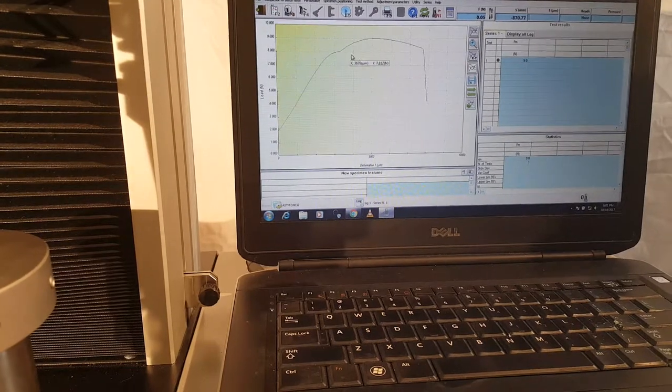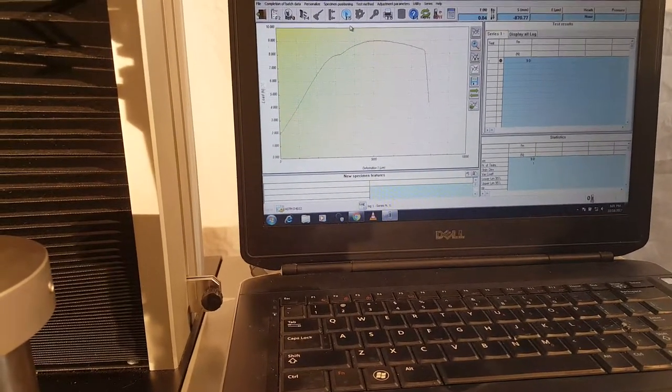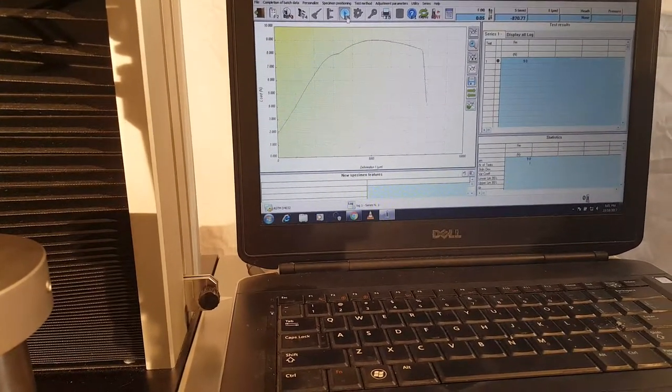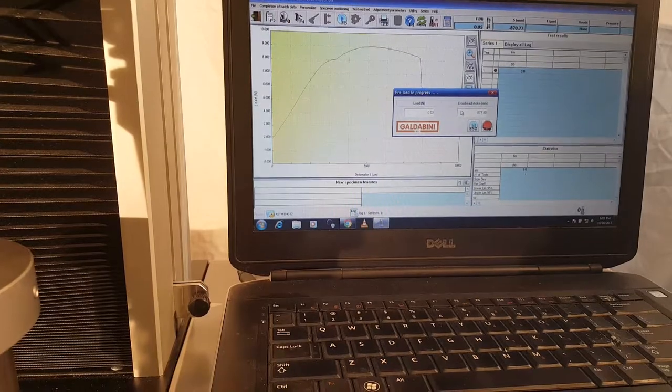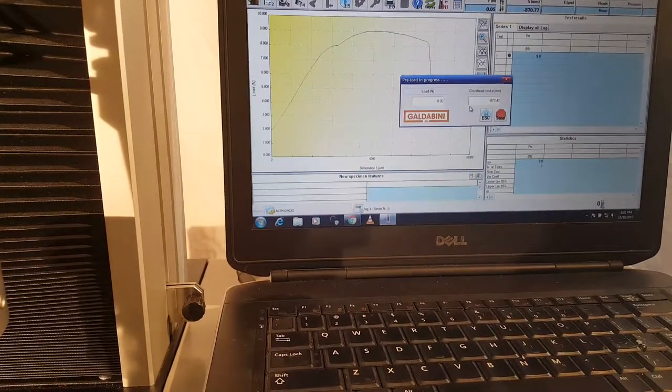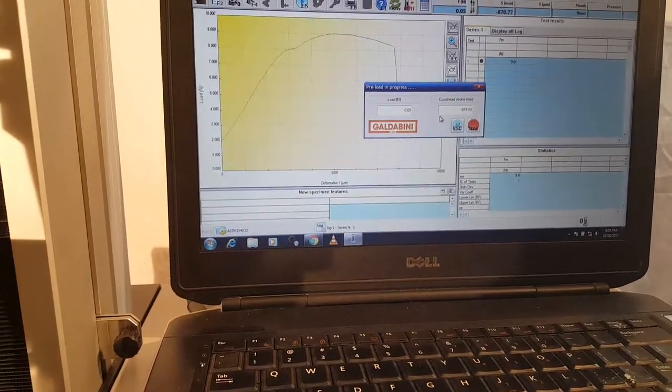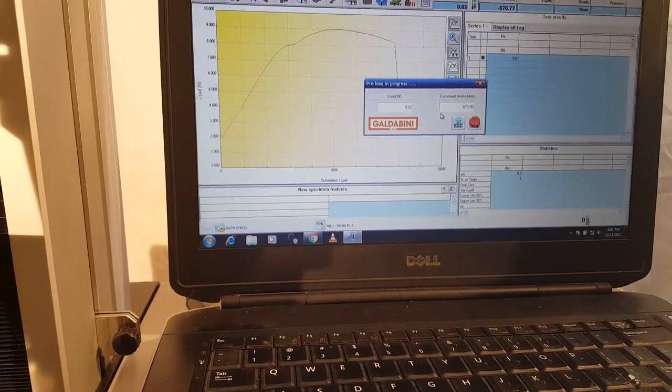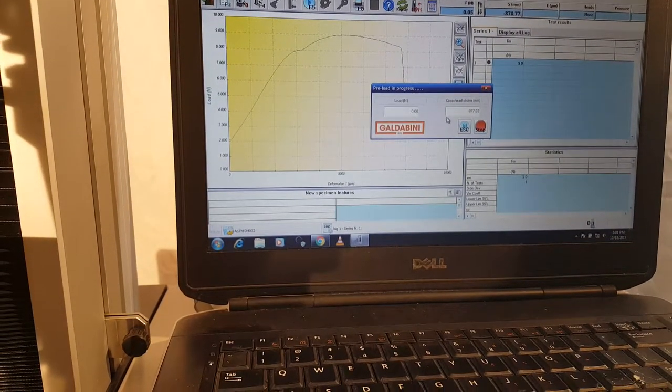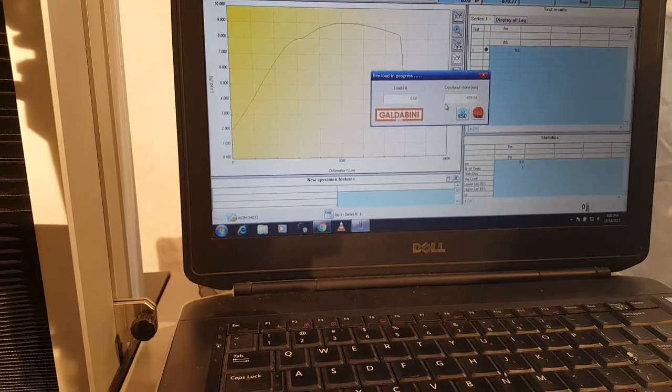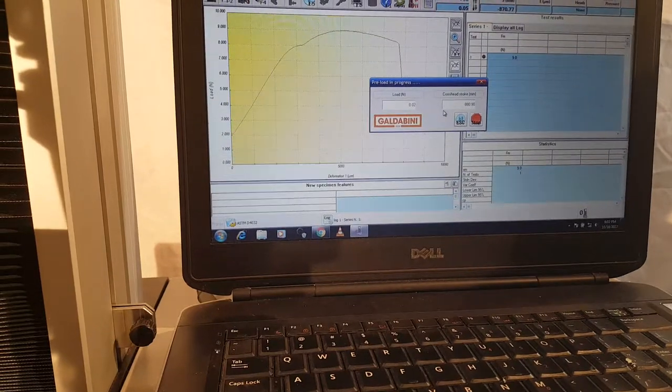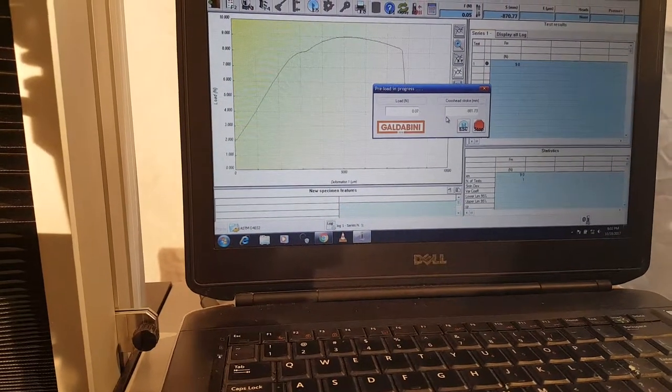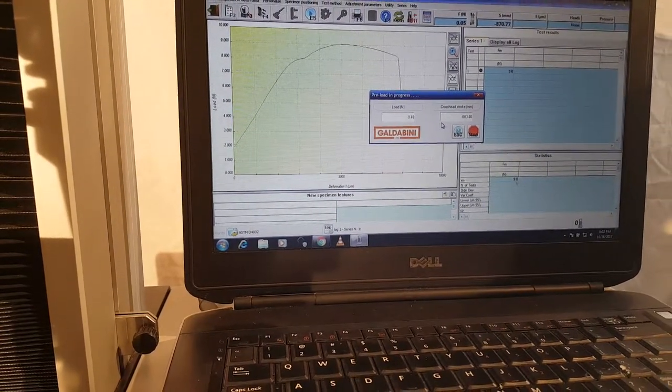I already have a test that I did, and you can see the data here. I'll do another test - test number two. I have it set up to start with a slight preload, about two newtons. Once it hits the sample and that preload rises, we'll get started. Okay, here it goes.